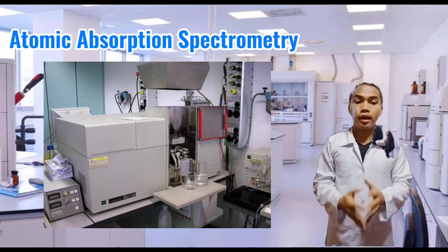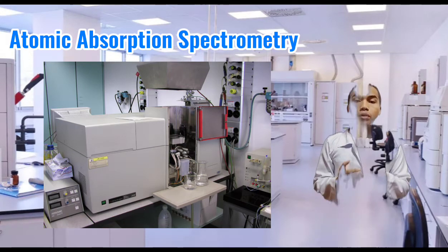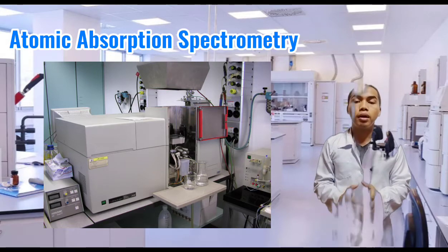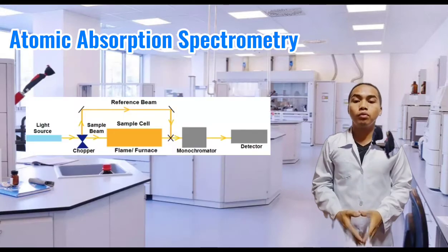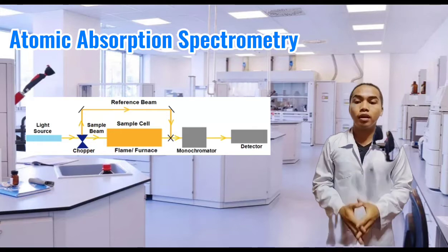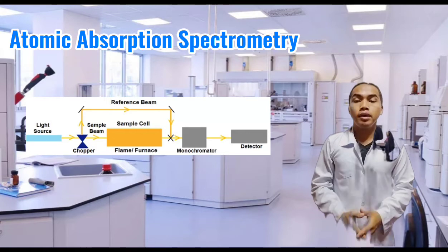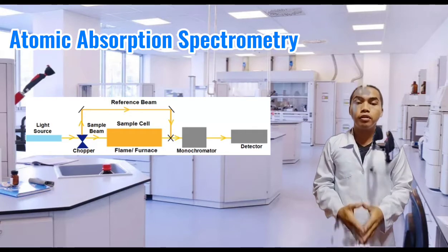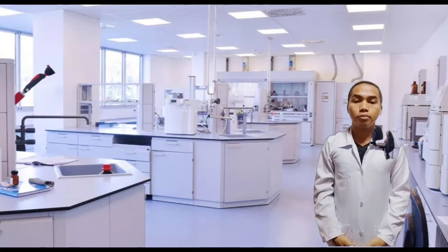It is used to detect elements, in either liquid or solid samples, through the application of characteristic wavelengths of electromagnetic radiation from the light source. Individual elements will absorb wavelengths differently, and these absorbances are measured against standards. In effect, atomic absorption spectrometry takes advantage of the different radiation wavelengths that are absorbed by different atoms.